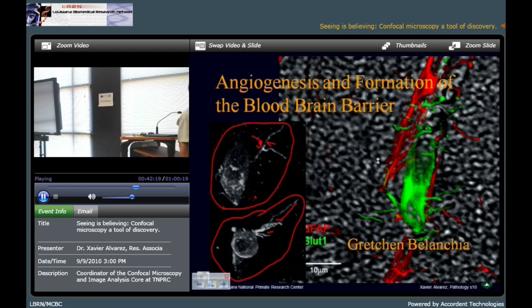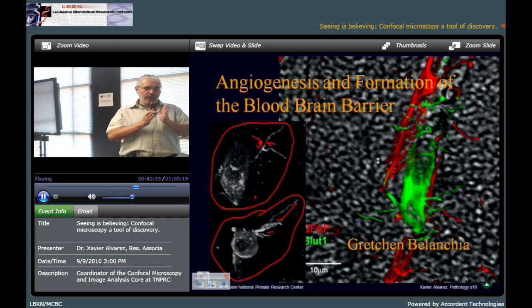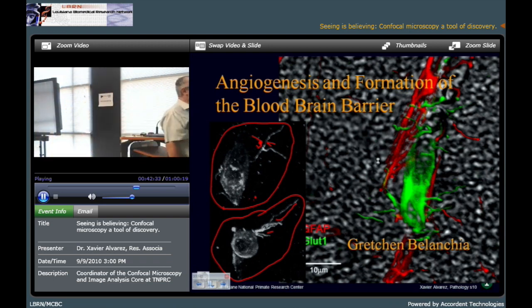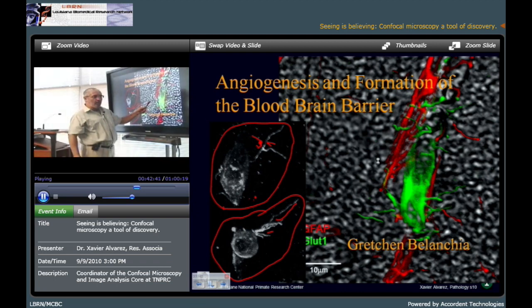Hopefully you could see that there are 2 lines there, okay, and 2 lines here. We're able to see the membrane that is going like this outside. And I don't know what they are doing. They are vessels. They shouldn't have those things. But it's very clear that these little arms are in close contact or tangled with the astrocytes. This is the astrocytes, okay?